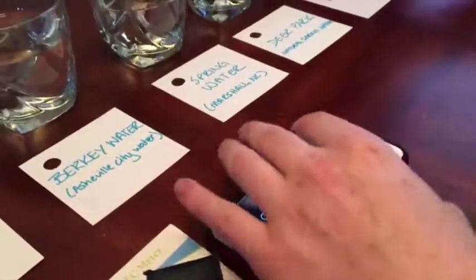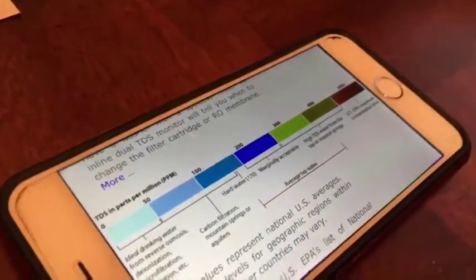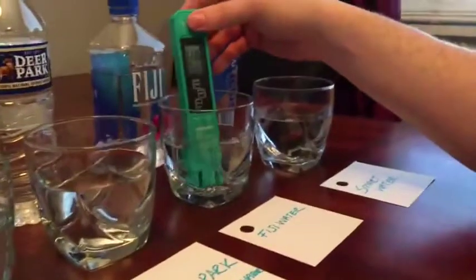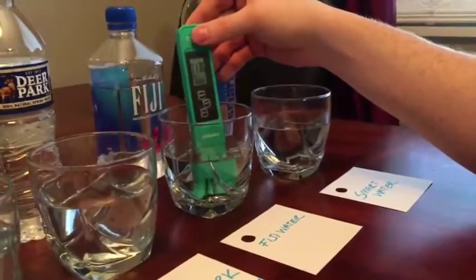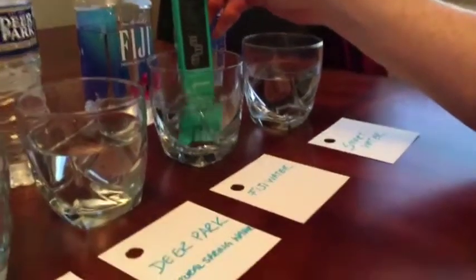So again, let's look at this chart again. 0 to 50 is acceptable for drinking. Carbon filtration can yield sometimes 50 to 100. Very hard water is going to be up here close to 200. This right here, Fiji, this expensive artesian water, has very high parts per million. So it makes you wonder what is in this water. It doesn't seem very clean.